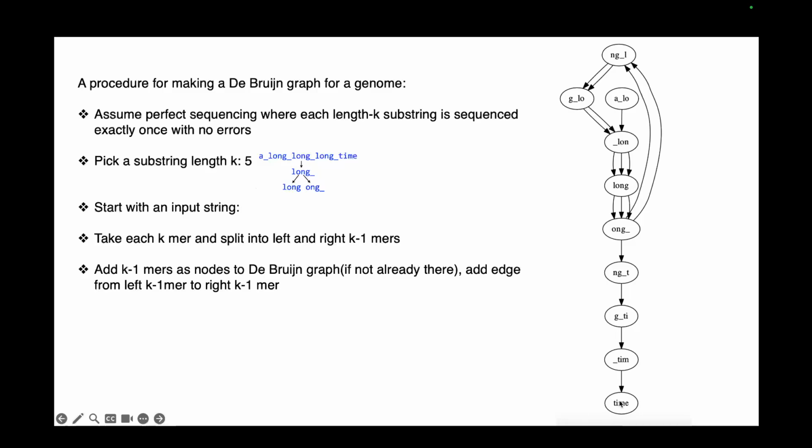Now, if you start from here, the probability of going here is the most. Now from here you can go here, then from here you can either move up or down. So this is how the Eulerian walk will decide which path is correct. Is this the best path to go, or is this the best path to go? You will have Eulerian walks for different types of paths with different cost functions, and the best one will yield you the lowest cost.